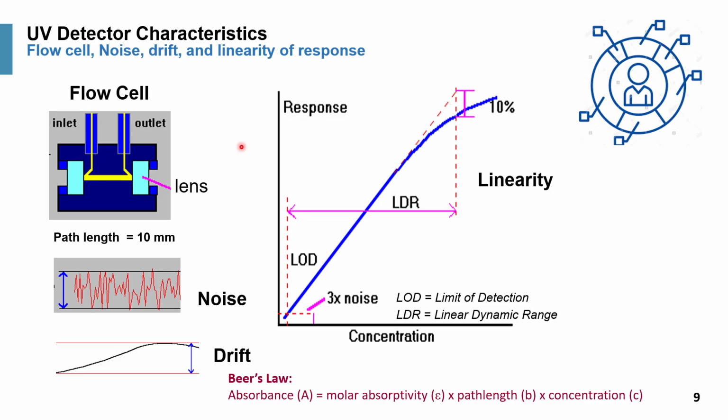And here's the response graph, in terms of absorbance versus concentration of a particular analyte. Note that the linearity is measured by the linear portion of the response curve, typically 5 orders of magnitude, and eventually above 2 absorbance units, signified by the loss of signal. At 2, there's only less than 1% of the light getting to the detector. So eventually, the UV detector would get saturated.